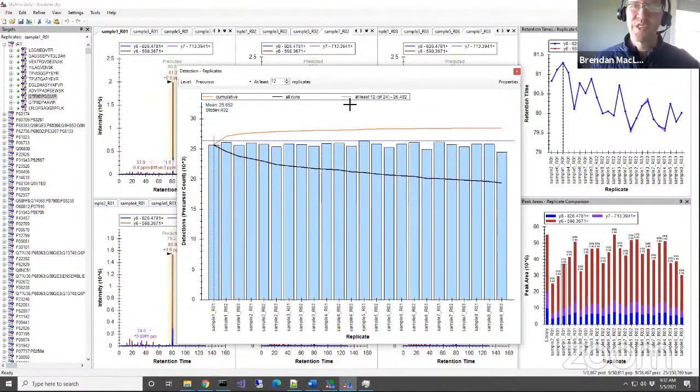If this curve were just going up and up and up, that would mean that there's not a lot of overlap. There's a bunch of stuff in here that's just accumulating. So if you see this cumulative score really take off, that's indicative of a false discovery rate problem. When we look at this, we go, yeah, probably not a false discovery rate problem. We're not finding a whole lot of new things. Of course, part of that is that we are finding almost everything that we're looking for.